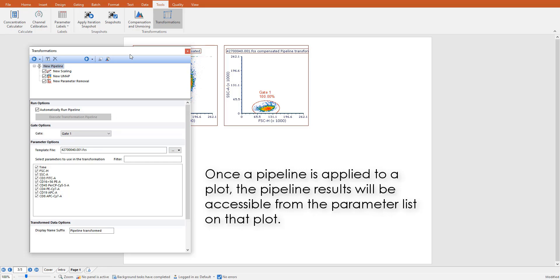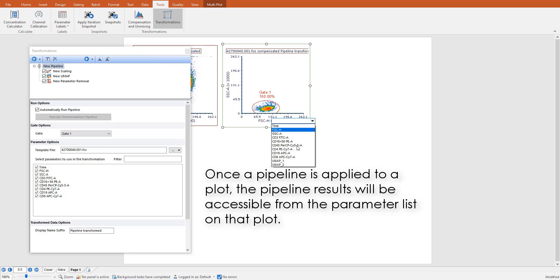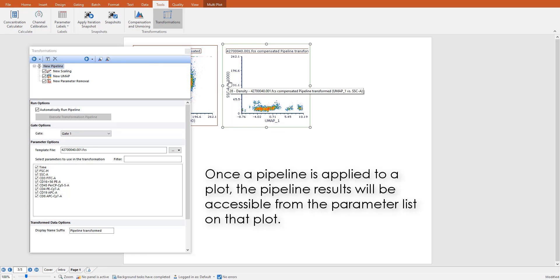On plots on which the pipeline has been applied, the pipeline results will be accessible from the parameter list.